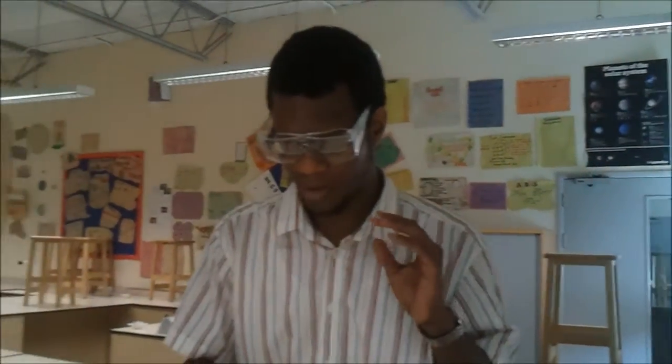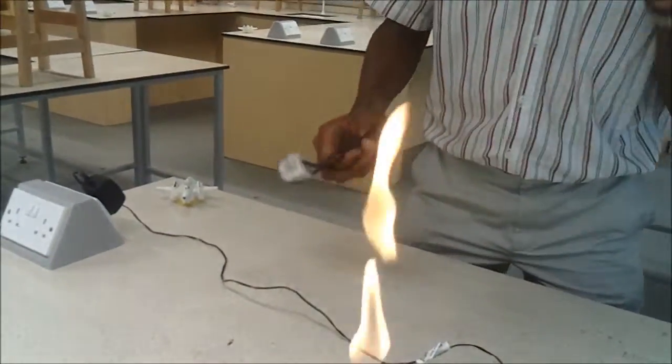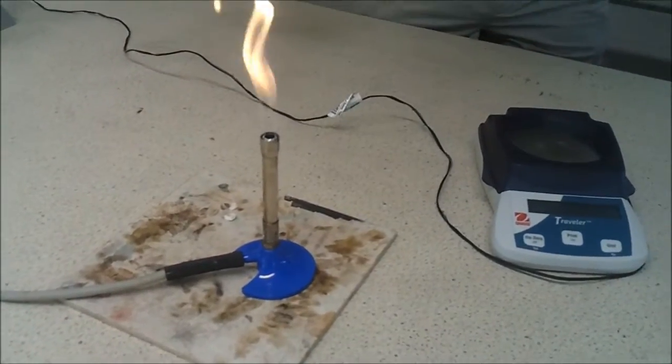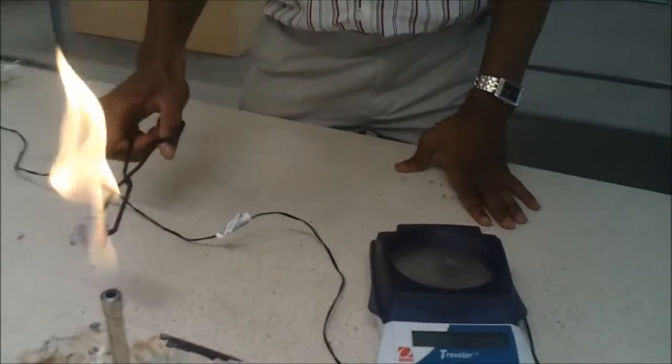So first of all, I've got my limestone here, tongs, heat proof mats, Bunsen burner on the safety flame, and scales. That's all I need.